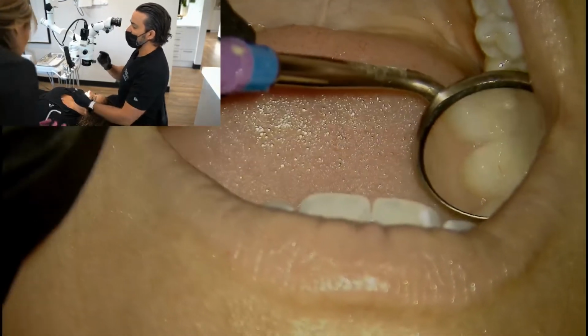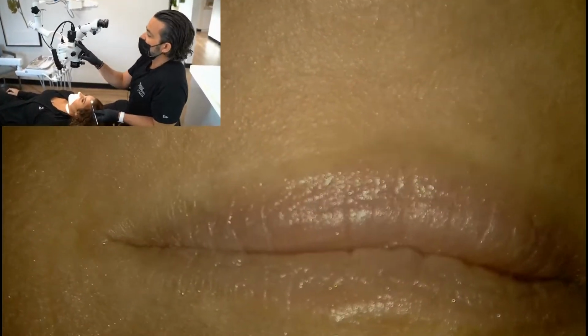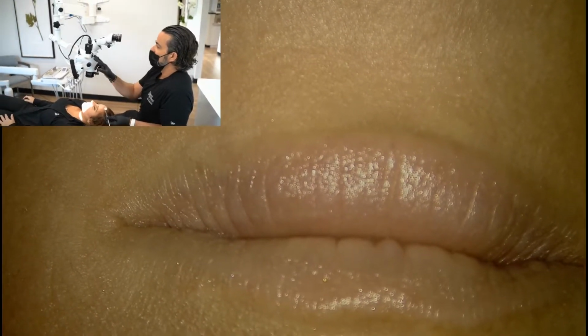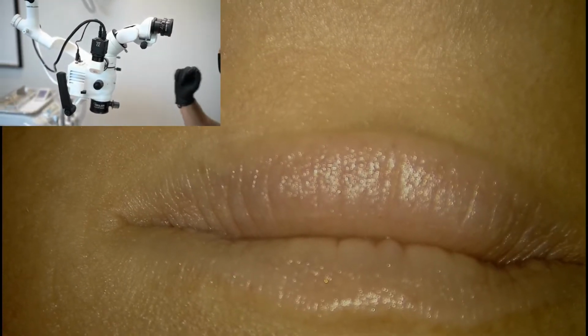Now, so that's point one. Point two, if you do cameras, I've got another variable up here. This is a beam splitter, and then I have a variable up here where I can parfocal this for this. So let's talk about parfocaling then.